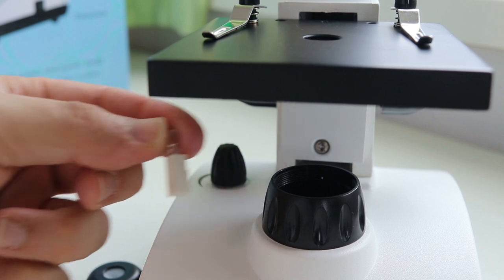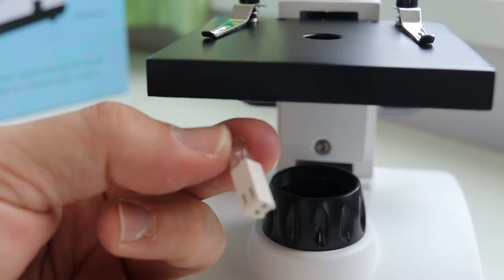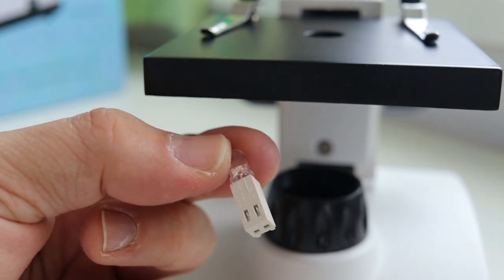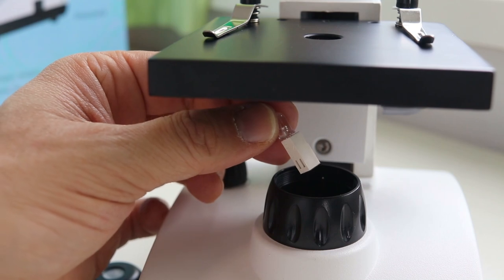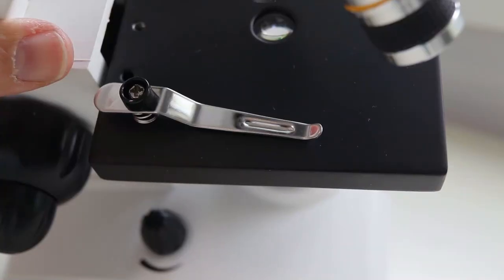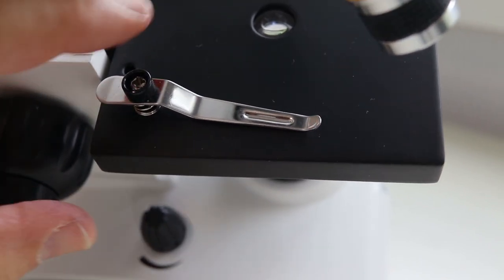Okay, that is basically how it looks. You simply have to take care that you put it in with the correct polarity again. Okay, let's put it back in again. Here we go. Now I did also see something quite interesting here, and you have to tilt the microscope.